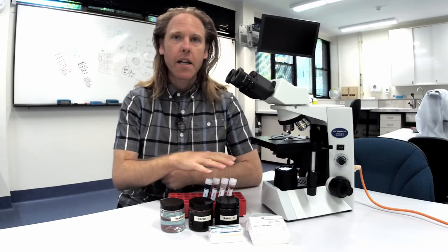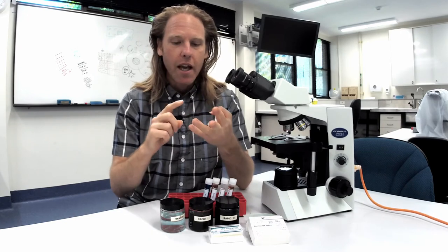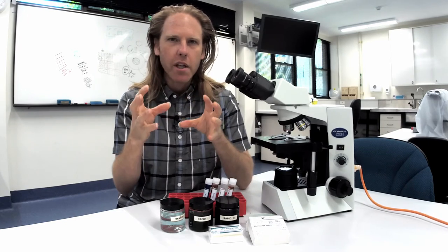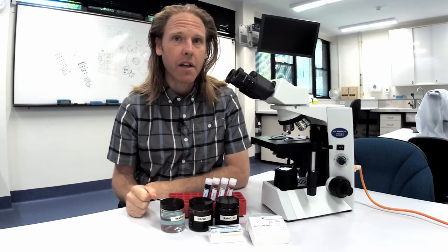Gram stain is used to identify bacteria and it's great for tape preps, ear cytology and samples from purulent or flocculent body cavity effusions to guide your antibiotic therapy while you're waiting on culture and sensitivity results.